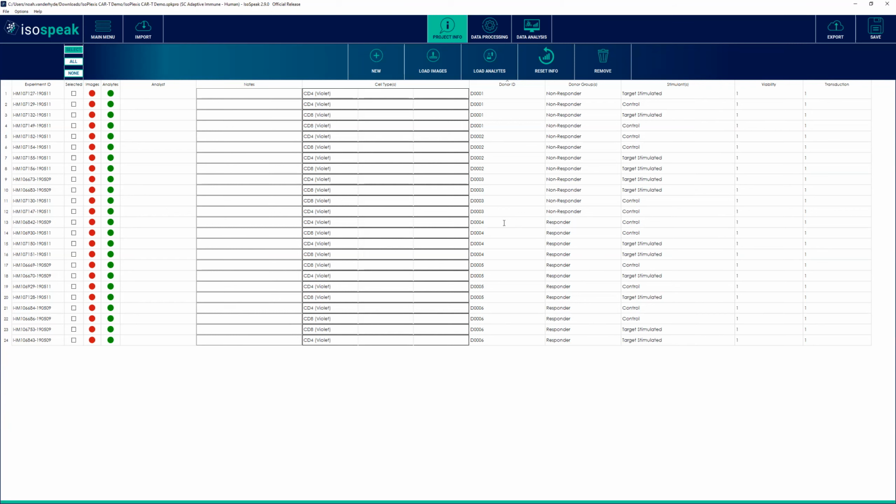Additionally, this group who was running this small clinical study wanted to see, in the manufacturing realm, if the control method, or the old method of stimulation and manufacturing, was better for CAR-Ts, or using this new target stimulated stimulation assay. Moving left to right, over here we have the chip IDs. Each chip will have its own numerical ID printed right onto it that's scanned by the instrument.